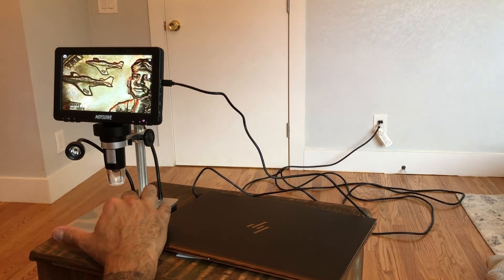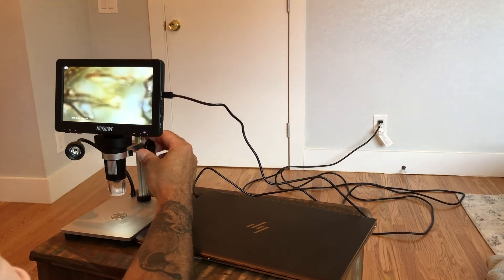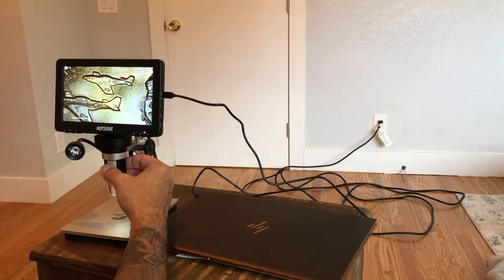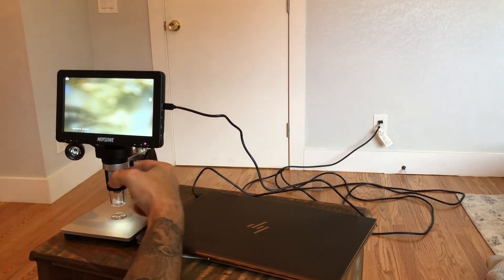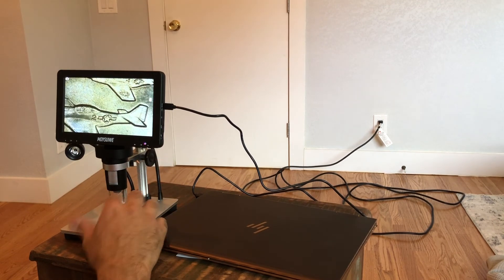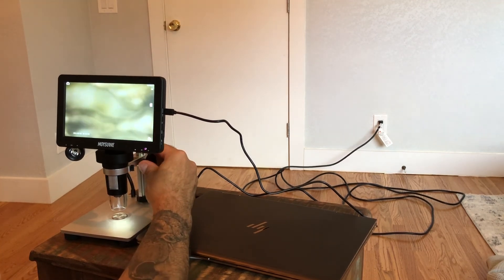Again, really nice microscope. If you want to get even more detail, you can go down really far, use that and then correct your focus, so you can really see the details of a quarter here. Overall, really easy to use and super happy with this microscope.